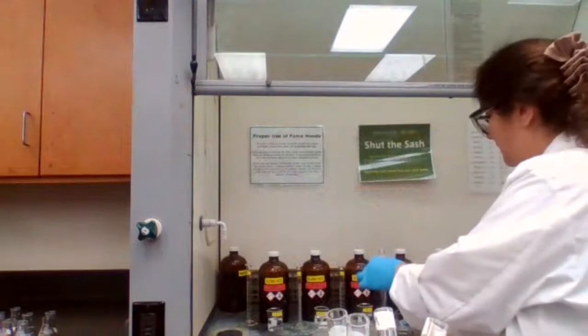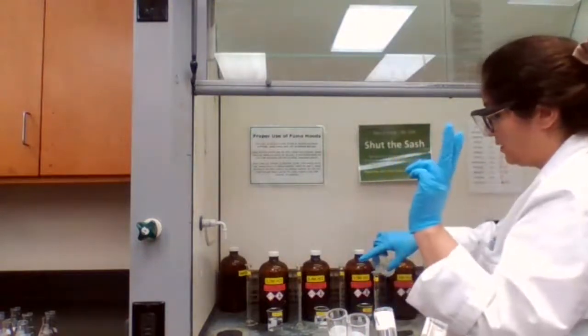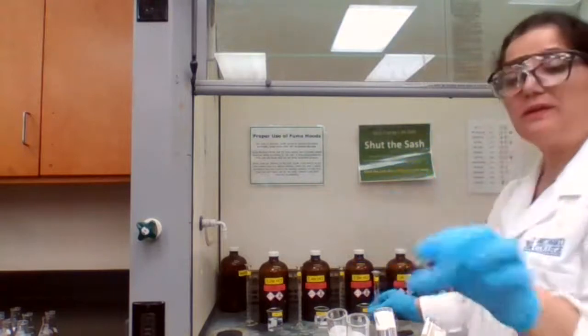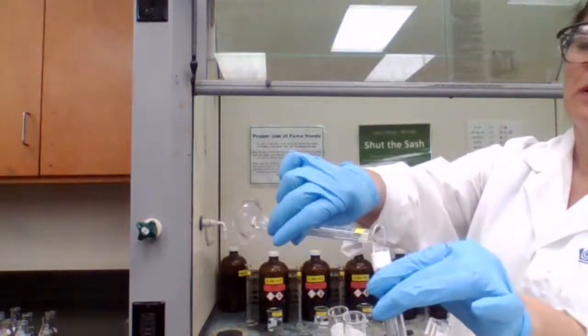Then 8 milliliters of the 1 molar to test tube 2, because I added 2 milliliters of water already. So the total is 10 milliliters. And you can calculate the concentration.